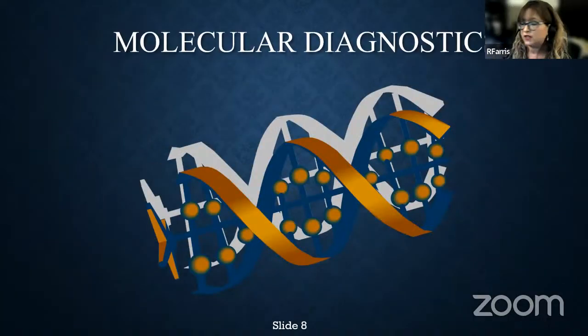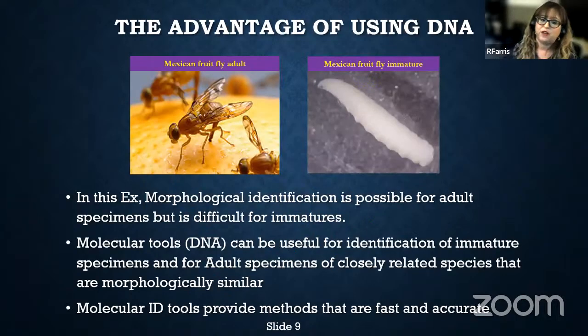I'm going to discuss a little bit of the molecular diagnostics that we do in our laboratory, just to give you all some background and some ideas, so when I mention certain things, you'll have an idea of what I'm talking about. Before I get into all that, I just want to emphasize the importance of why we use DNA.